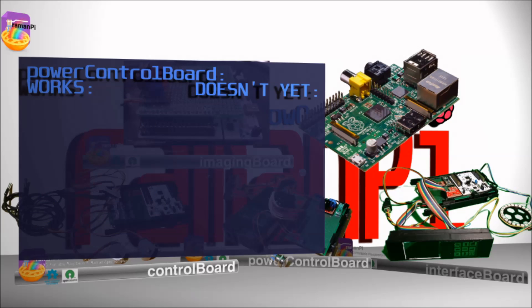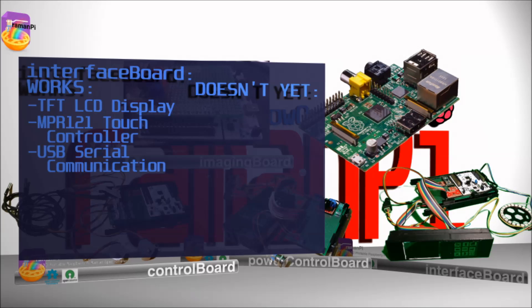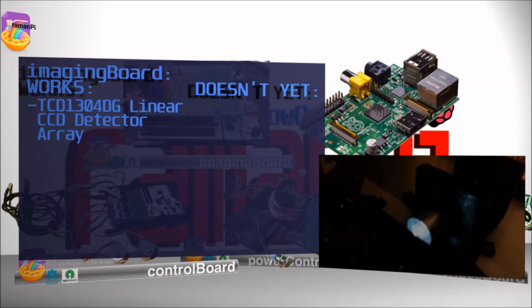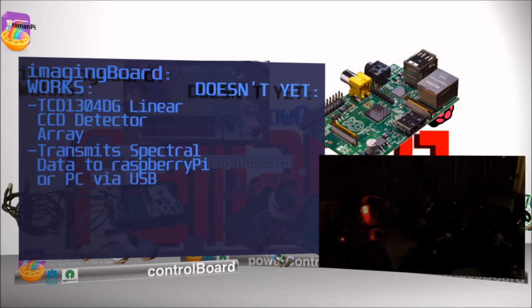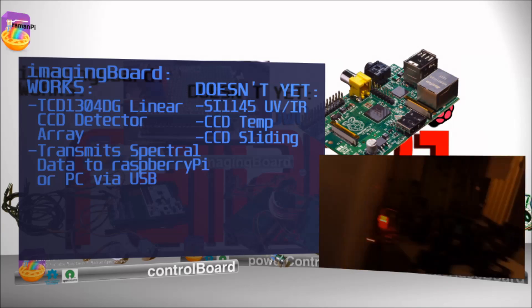The power control board currently performs all of its planned duties, which include taking in power from the Mini-ITX power supply, supplying power to all other boards, housing the L298H bridge and current sensor, and controlling the system power with a stainless steel button. The interface board controls the TFT LCD display and takes input from the touch-sensitive keypad, communicating that data to the Raspberry Pi. It also controls the Arduino Pro Mini that drives the RGB LED ring. The imaging board controls the CCD detector array and obtains spectra, which it sends to the Raspberry Pi or PC via USB. In the future, it will monitor UV index for fluorescence detection, monitor CCD temperature to compensate for noise, and move the CCD tiny fractions of a millimeter side to side to increase resolution.